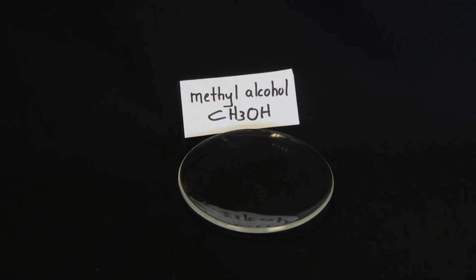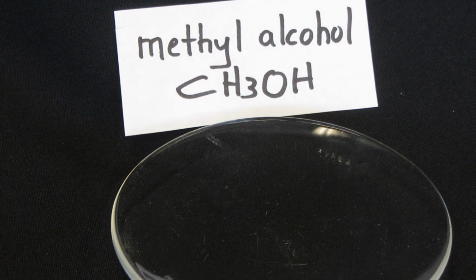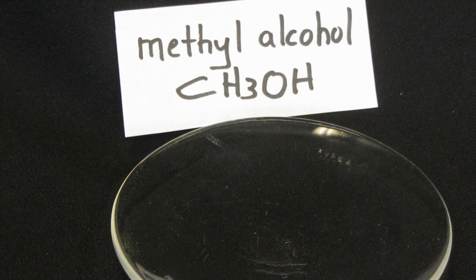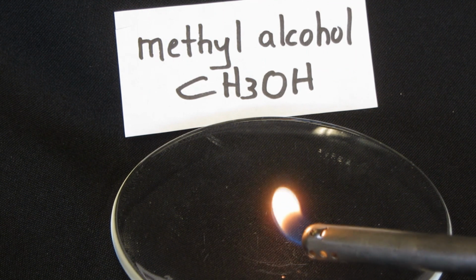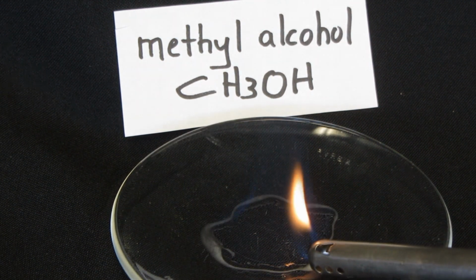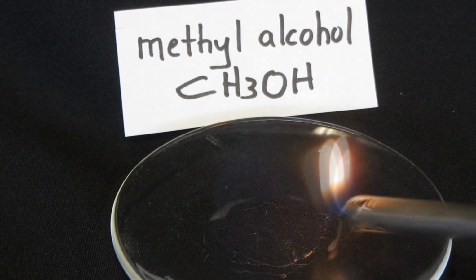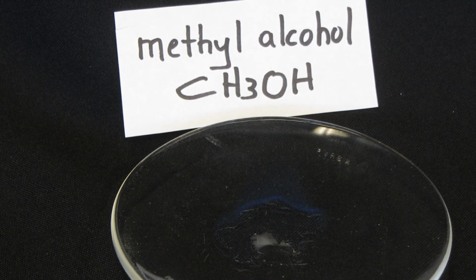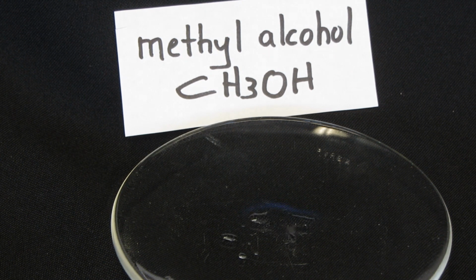This is methyl alcohol, also known as methanol. Now, methanol has a low boiling point. It's 65 degrees Celsius, which means it's very volatile. It's easy to ignite. So the first contact with a flame should get it started. There it goes. Notice the flame is pale blue, almost invisible. Now, it burns with a clean flame because there's no evidence of any glowing carbon particles. There's no soot. And in that regard, it's a very good fuel.